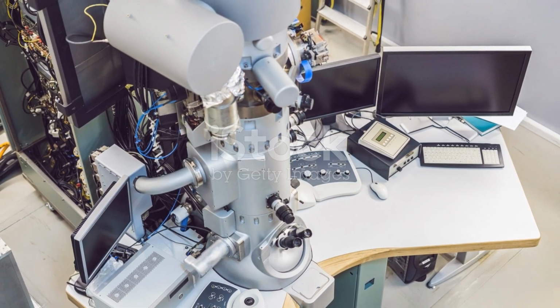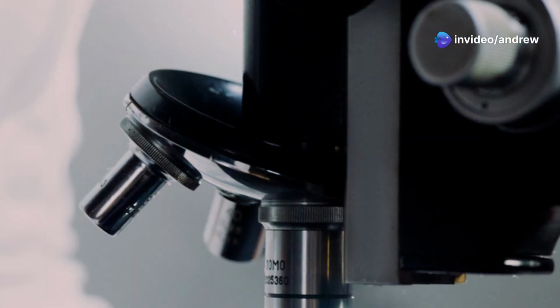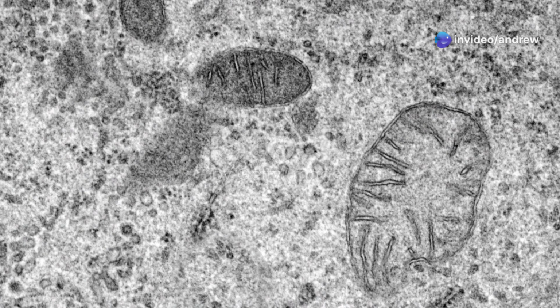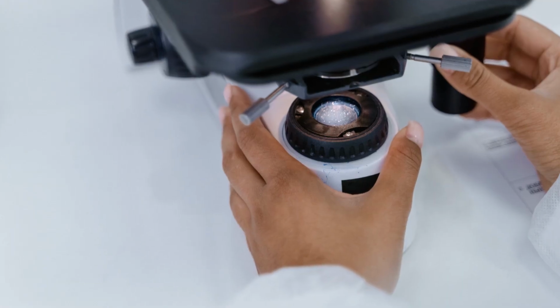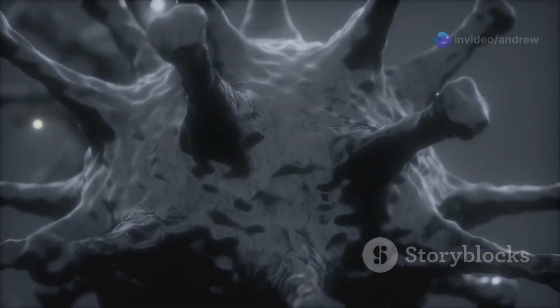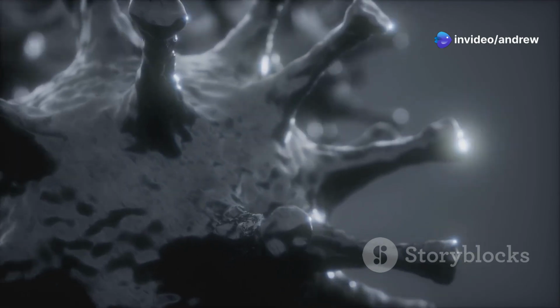The transmission electron microscope, or TEM, is a type of electron microscope that transmits a beam of electrons through a very thin specimen. The electrons interact with the specimen and are then detected to form an image. TEMs are very powerful microscopes and can achieve magnifications of up to 10 million times. This means that they can be used to see objects that are just a few atoms in size.